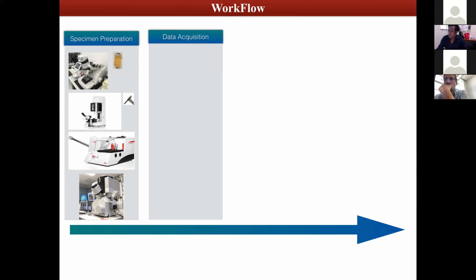Okay, so one of the things, as I was telling, sorry, I lost myself. Once you have put the sample in the system the second time, you do not have to play around with the parameters. You will just use the previous setting, and the instrument will automatically take it up from there and give you the result. That is what we call a recipe.